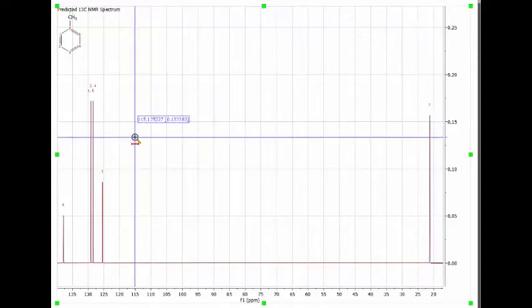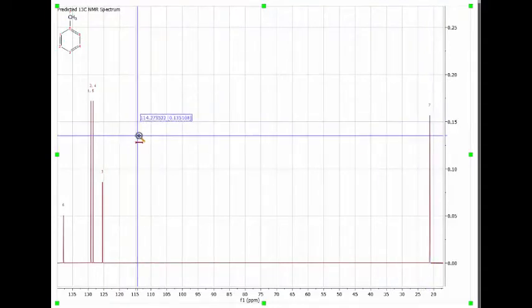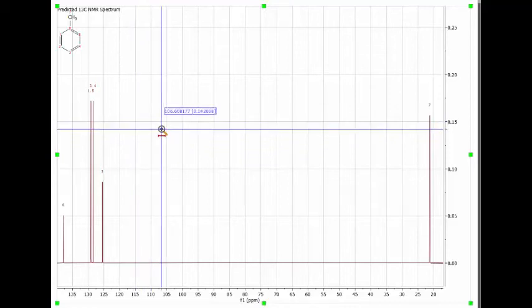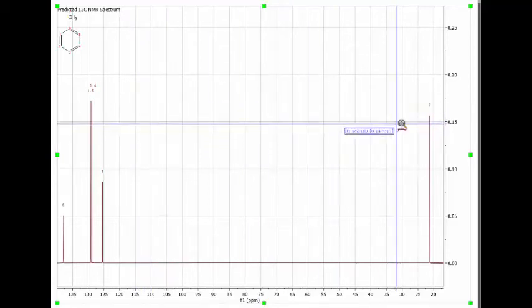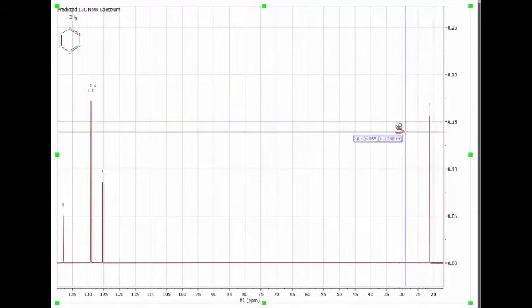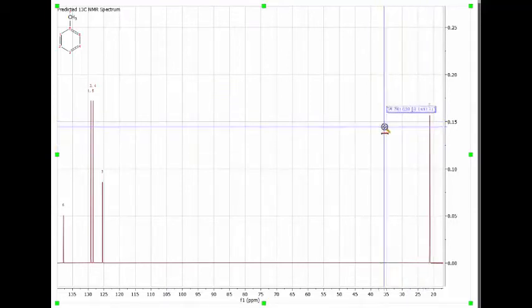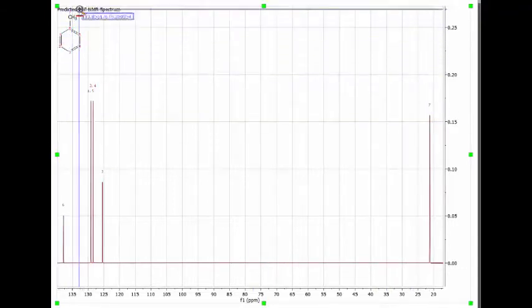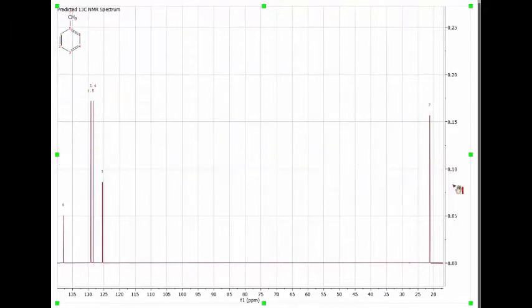And again, the way we suppress the CH information in the spectrum has the neat side effect of pumping more energy into the carbons through the H's, and so the more H's bound, the higher the signal will be. Which is mainly why we can't actually integrate C13 spectra. It doesn't work, because we're monkeying with it. We're adding energy, and the more H's bound, the higher it'll be.